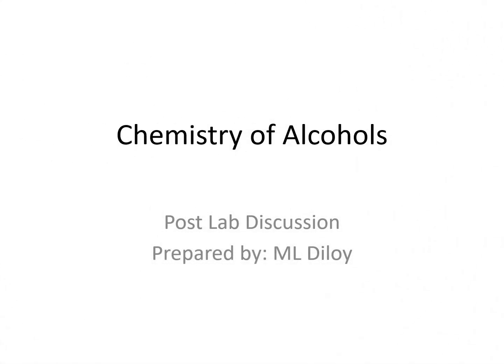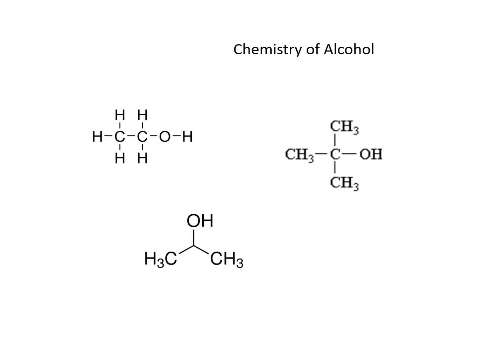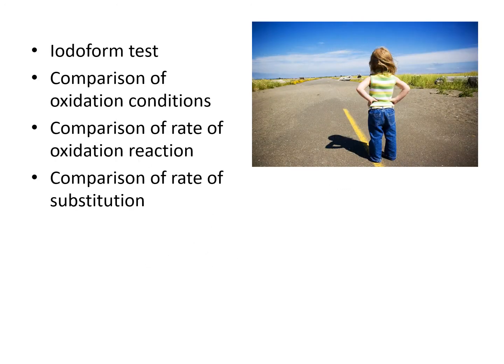Hello class, this is a post-lab discussion on alcohol. We recall primary, secondary, and tertiary alcohol. This presentation will cover the iodoform test, oxidation condition, rate of oxidation, and comparison of rate of substitution.